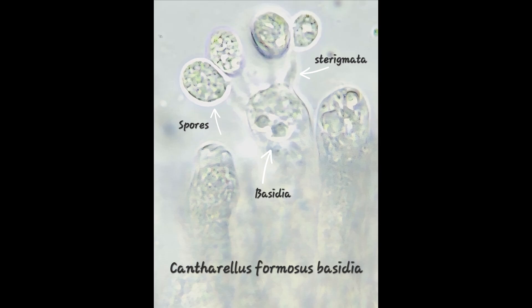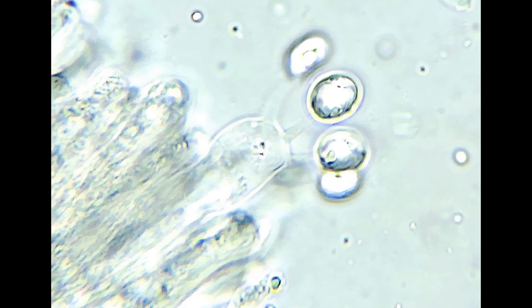And then again in this next picture, there's Cantharellus formosus basidia with four spores. So typically basidia produce four spores — some produce just two spores, like your grocery store button mushroom, Agaricus bisporus — bisporus meaning two spores per basidia. But these ones clearly have four spores growing on that structure, and that's a really nice shot of the basidia.